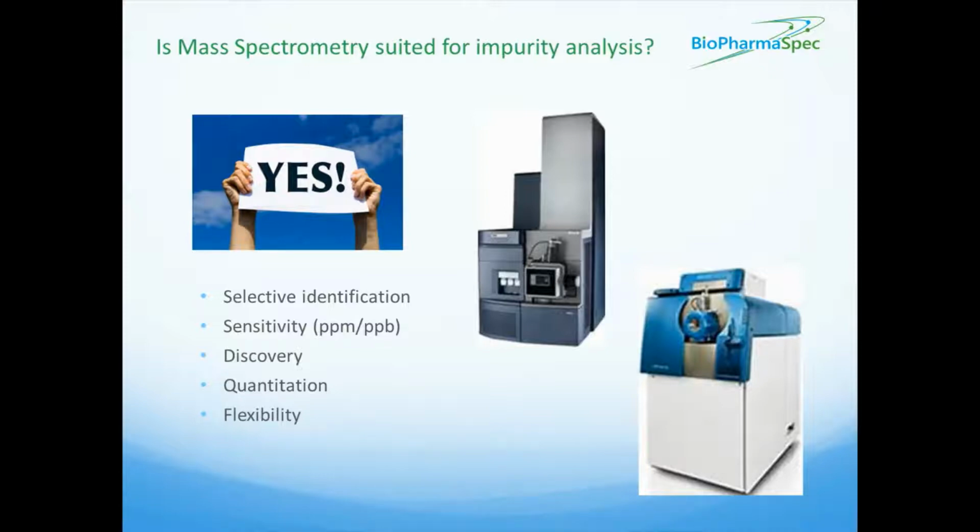So, can mass spectrometry help us here? Fortunately, the answer is yes. And for good measure, I list a few reasons why mass spectrometers are excellent analytical instruments for impurity analysis.